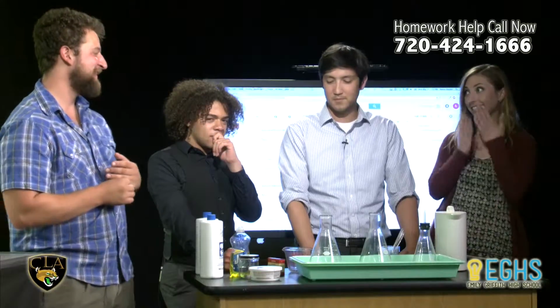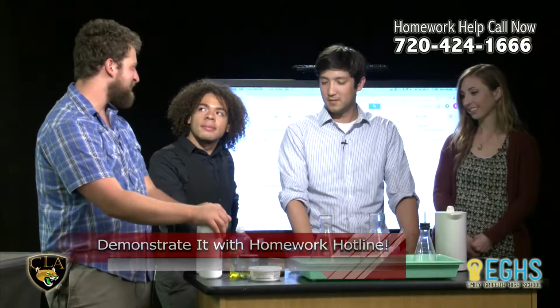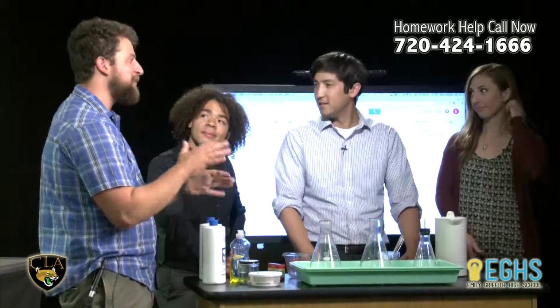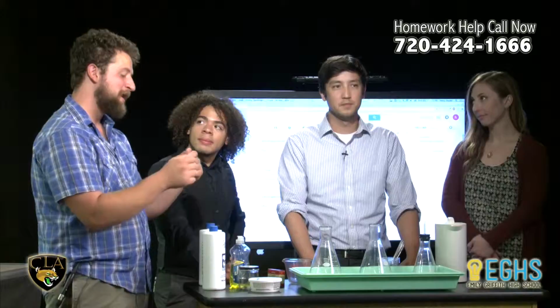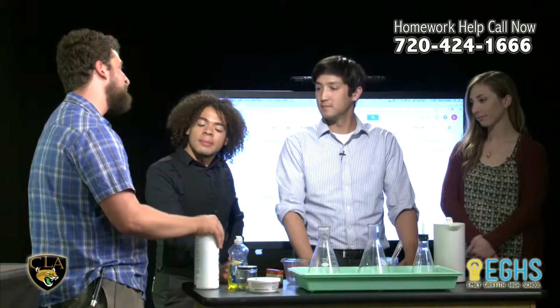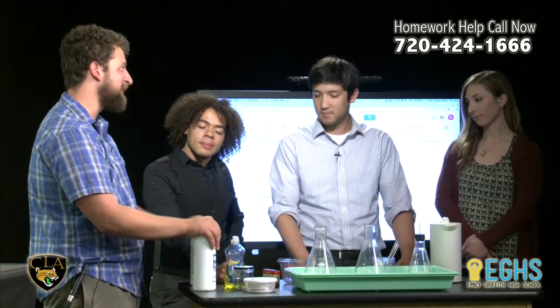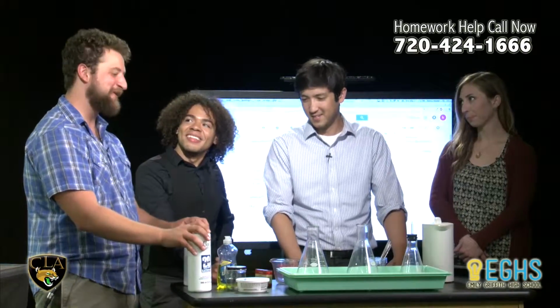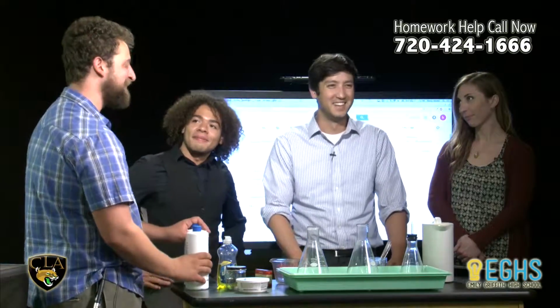Okay guys, so we're gonna do sort of a classic science experiment called elephant toothpaste. It's maybe something you guys have done before. Does this ring a bell? No. Nope, cool. Hopefully it'll be neat. It's a combination of a chemistry experiment, but it's also biology related, because we're gonna use living yeast to help us with this. It is kind of dark in the sense that we're going to kill all the yeast to make this happen, but there's lots of them.